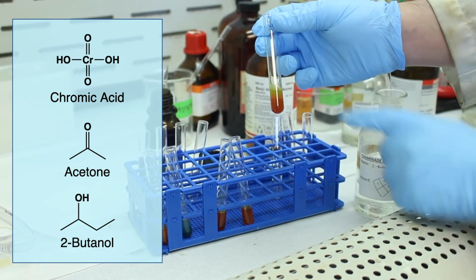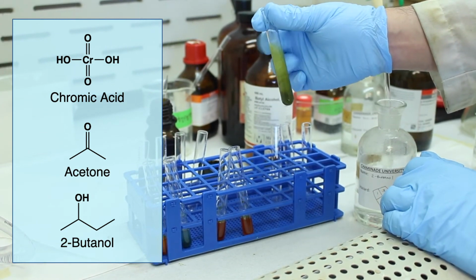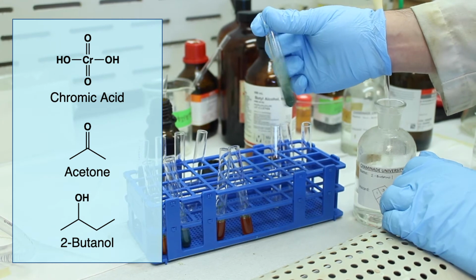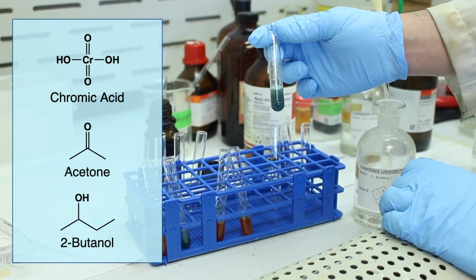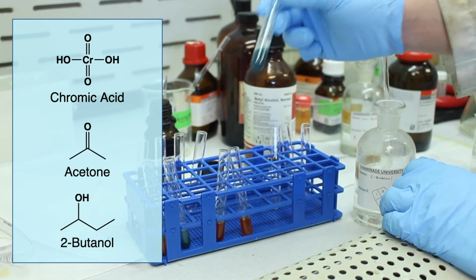Okay, you can see a little bit of color change. We keep agitating. There we go, green. So another positive test result.